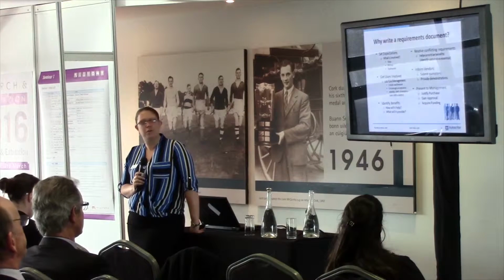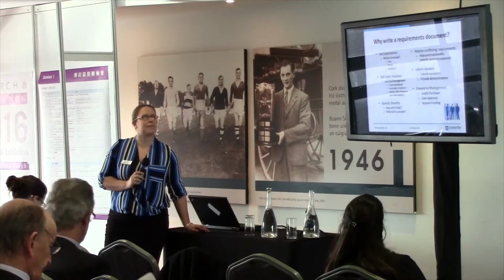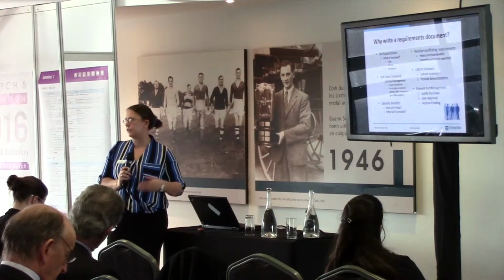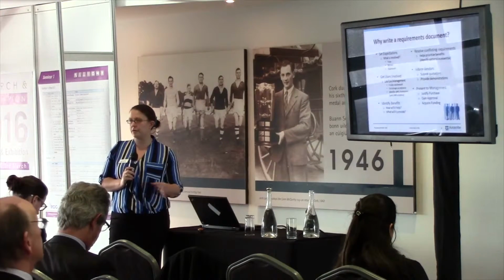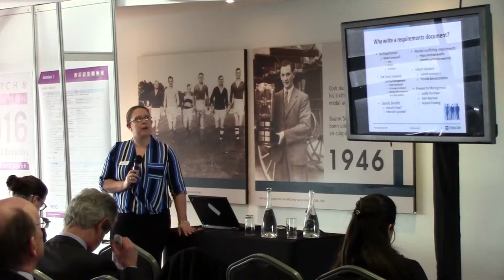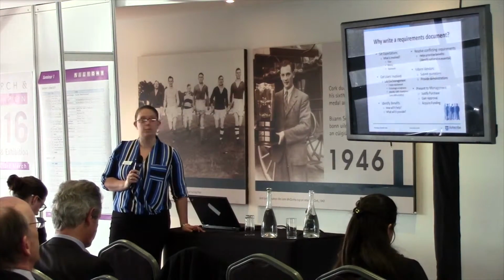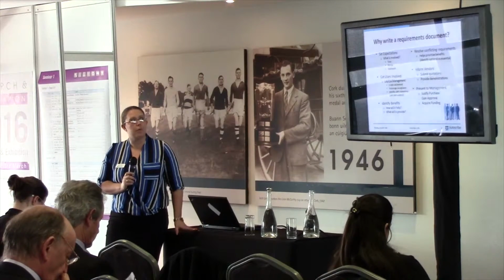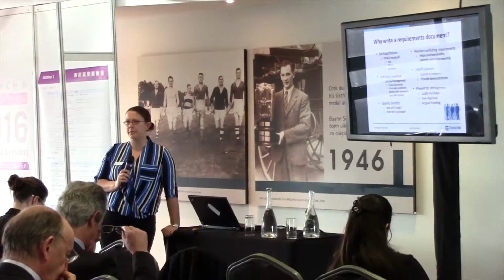And what you should have in there, there's quite a lot here. You need to set the expectations, how long it's going to take, the sort of money that's involved, the team members, everybody should be involved in this. You need to identify who this is going to help. What will it actually provide to you? What it's going to solve, and really that's when you start to speak to us.